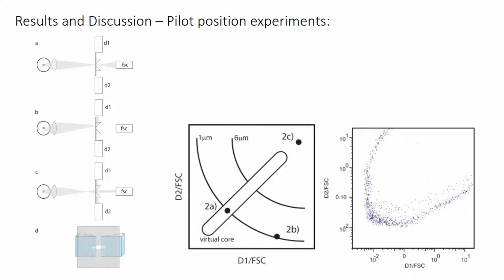So firstly, a simple test on the PSD is done to examine its capability to differentiate the different size and the position of the particle. Side-to-side motion of the beads of less than 25 micrometers for the two sides of the beads are done and measured to provide the information.